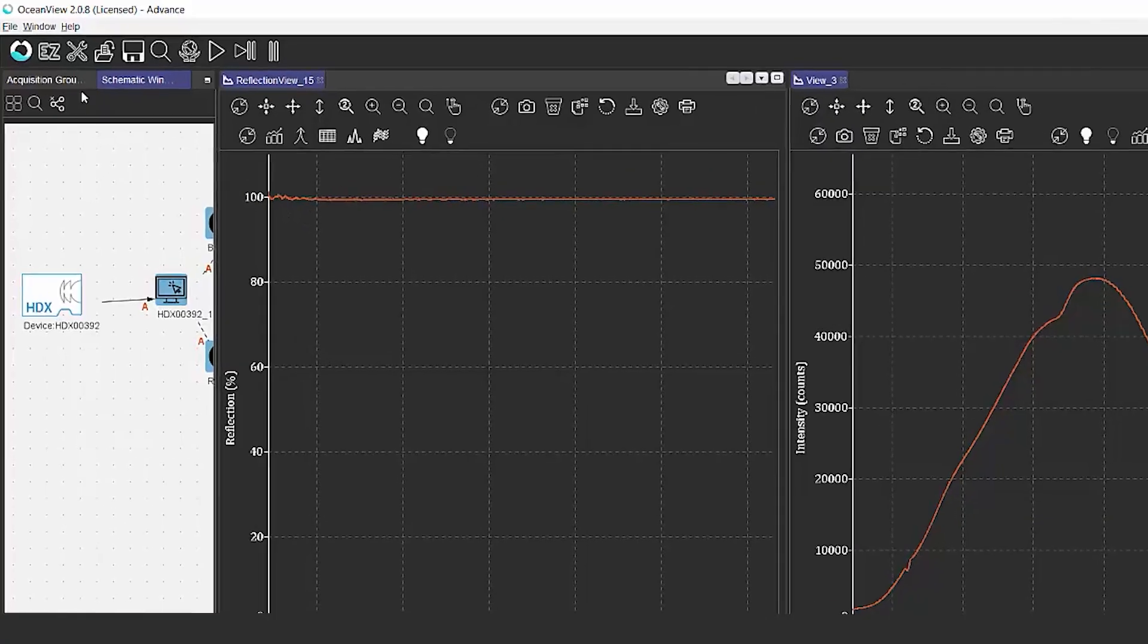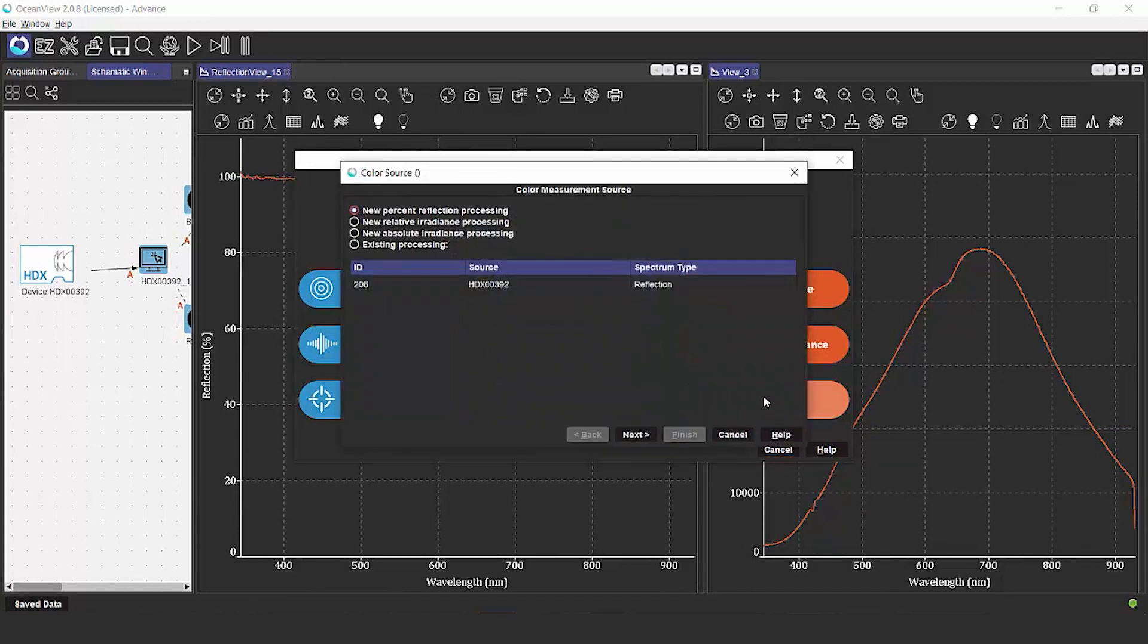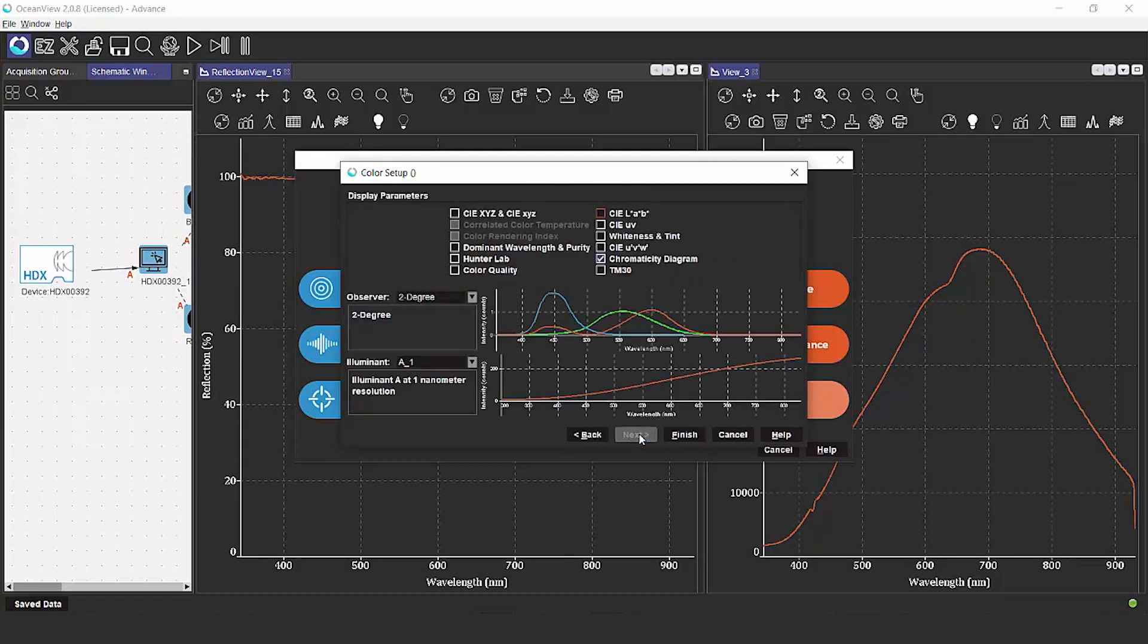We're going to open up the wizards by clicking here, and this time we're going to pick the color option. Since we've already got an outstanding reflection measurement going, we're going to go ahead and use existing processing.